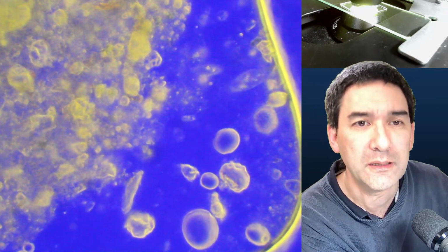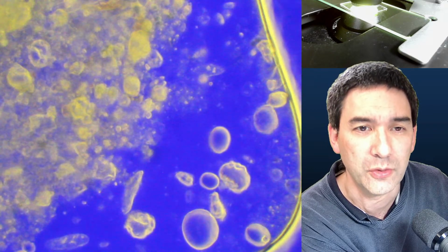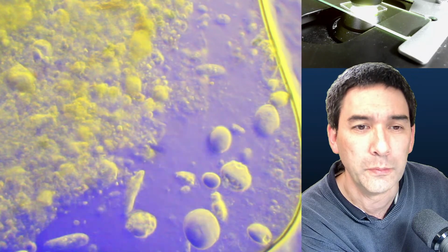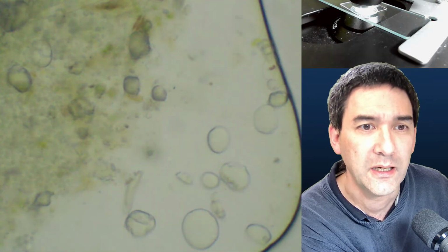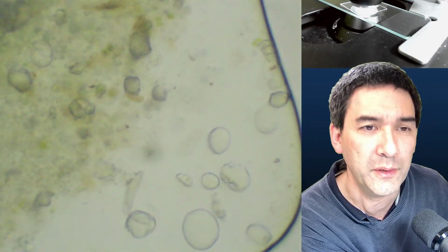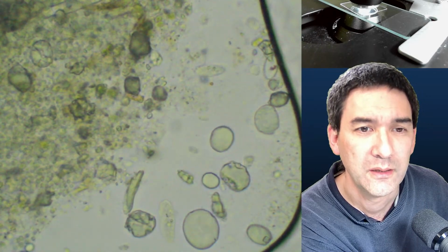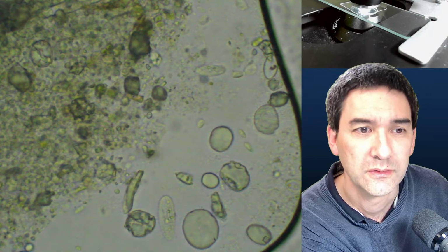Again, it looks a little bit not quite as good as if you were to look at it directly under the microscope. So if this is the stuff that you want to do, here a little bit oblique. And in bright field, as a comparison, I take the filter out. I have to go down with the light intensity. It looks very low in contrast because the condenser aperture diaphragm is open. So I close the diaphragm. Okay, this is how it looks in completely natural colors.